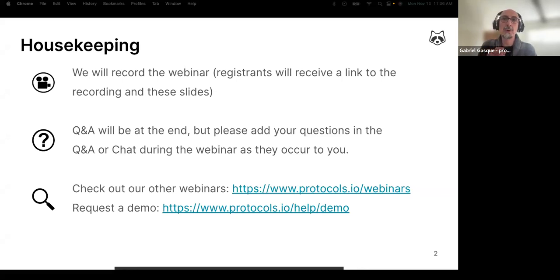And before we jump in, just a quick note. This is an advanced webinar. So in case you are not an advanced user, the platform is really intuitive, and the best way to familiarize yourself with the many different tools and functionality is just to log in and play around with it.